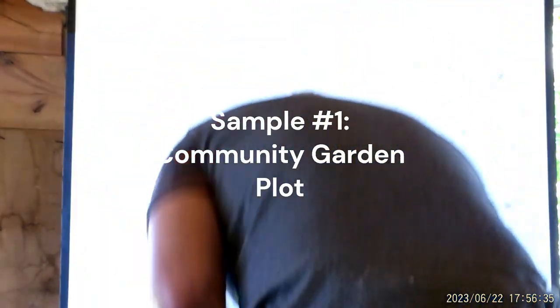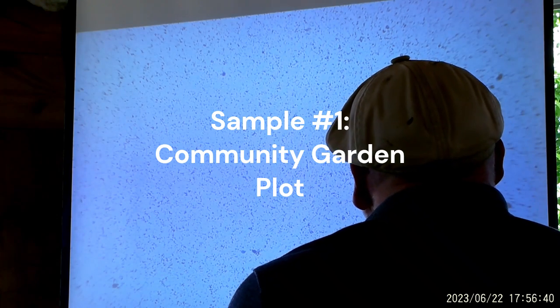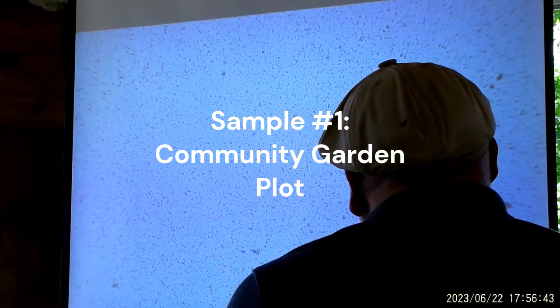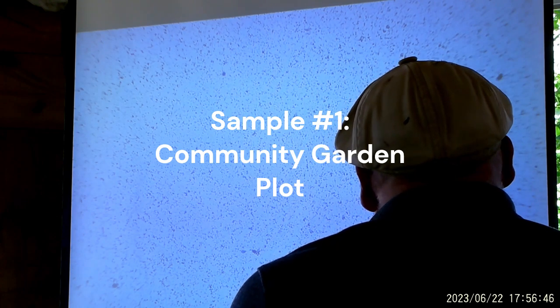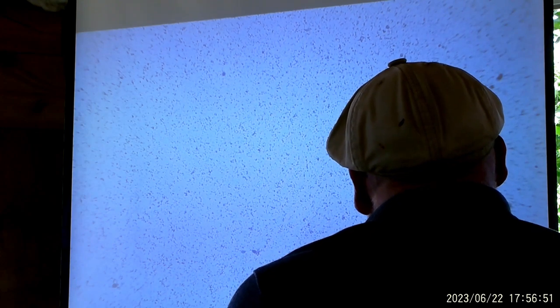All right. So right here we're at 4x magnification. Not a lot to talk about here. This is actually at the lowest magnification we have. We will go in a little deeper into this. But generally speaking, what you're seeing here is just sparse aggregation, maybe some aggregates here, and not much to talk about there.